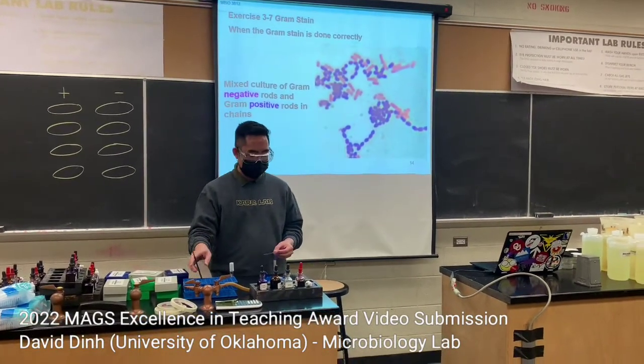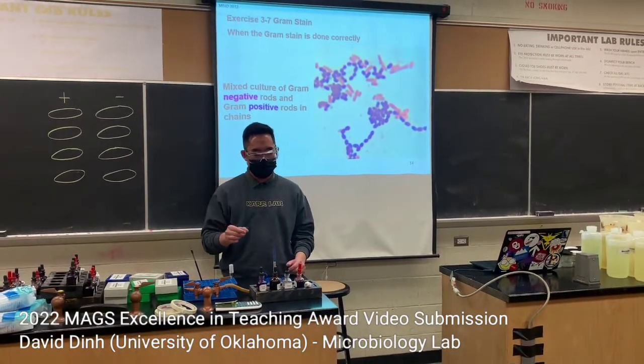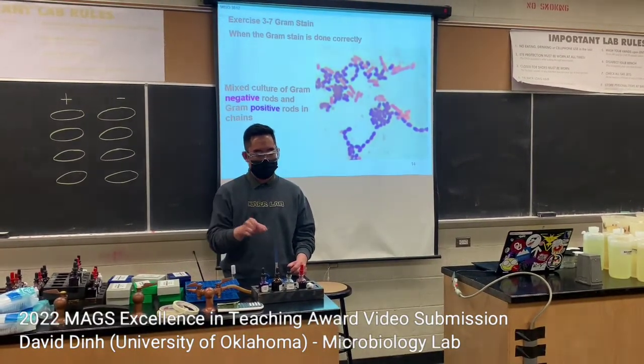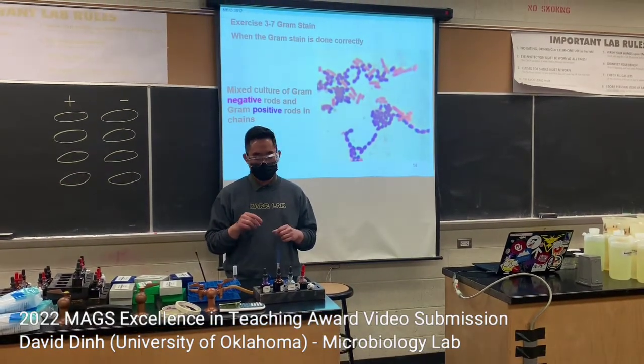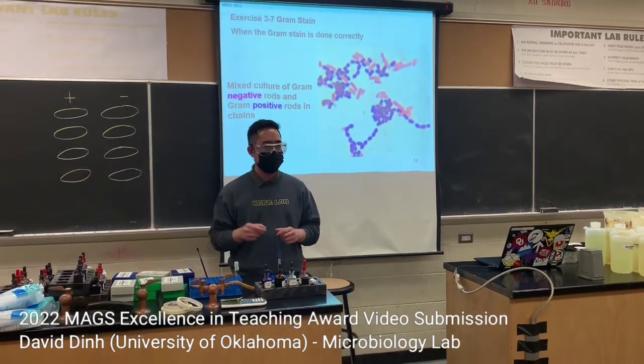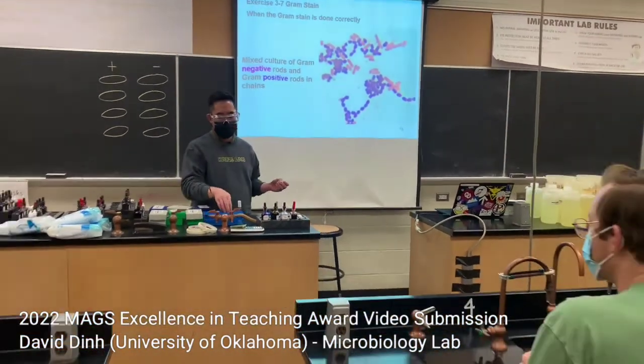So just for the purpose of the demo, I'm going to heat fix. You just need to pass the slide over the flame just a couple of times, just twice is enough. You can test it by gently touching your slide. If it's warm to the touch, then you've heat fixed it. Alright, and then that's it. You don't need the flame anymore.